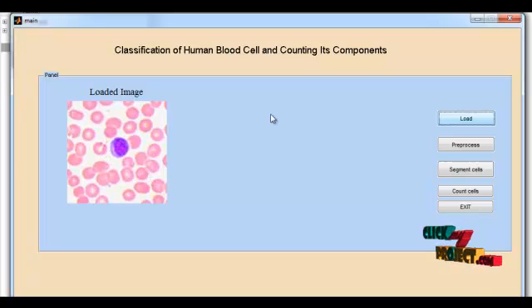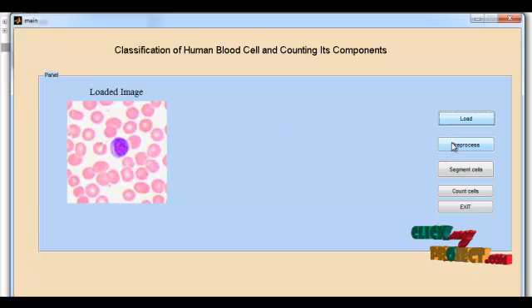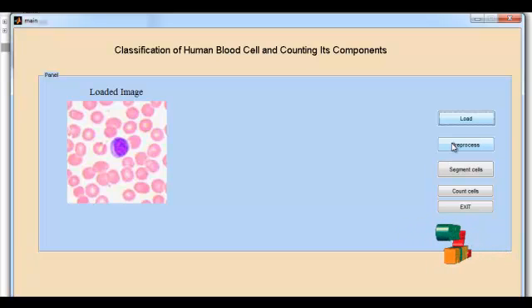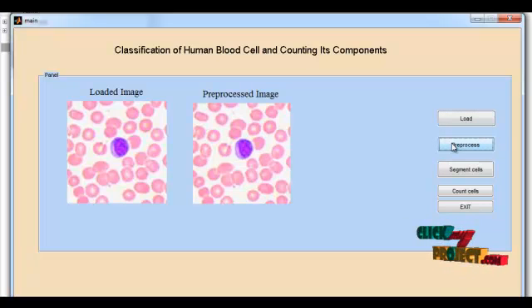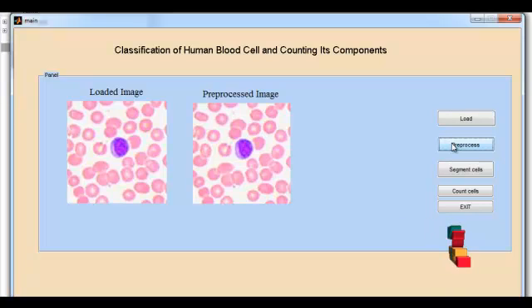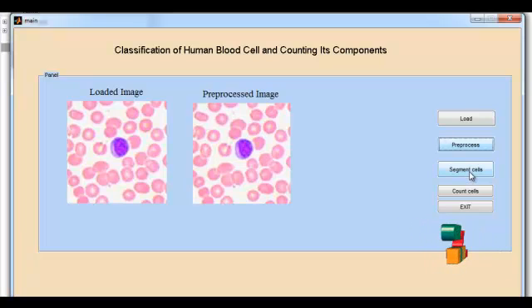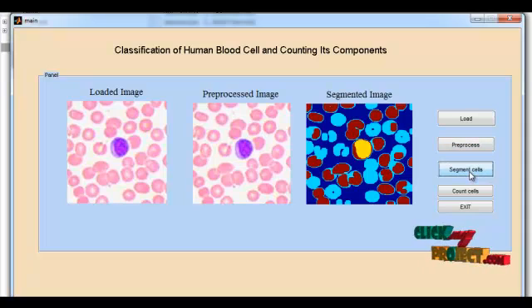This image consists of RBC, WBC, and also platelets. Then we perform the pre-processing step to remove the noises. Before that, it separates the red, green, and blue channels, and then performs the median filter for each channel. After that, the pre-processing step combines all the channels together and displays the pre-processed image.